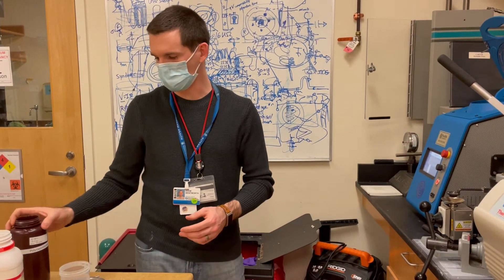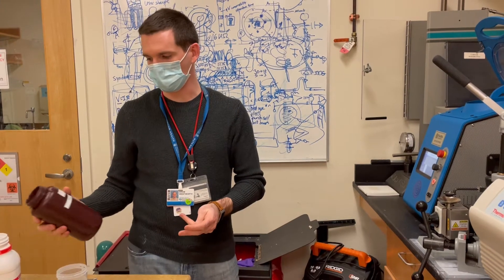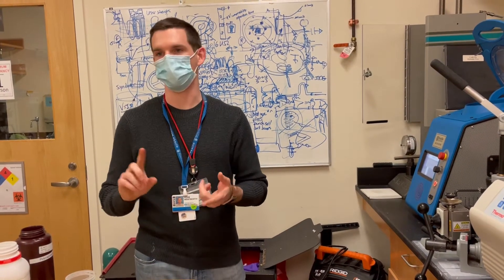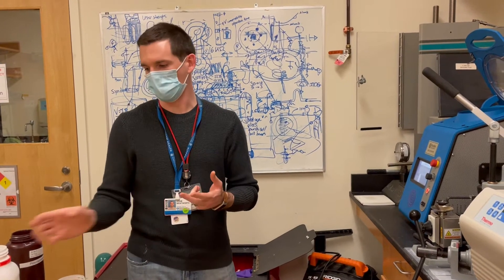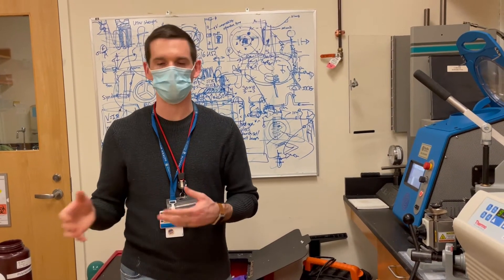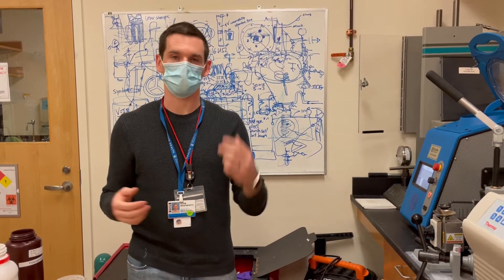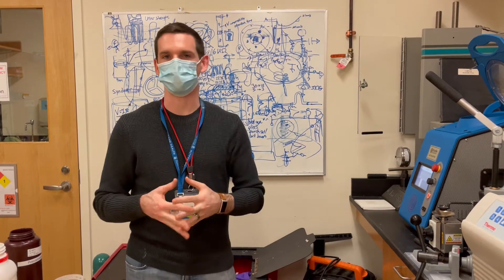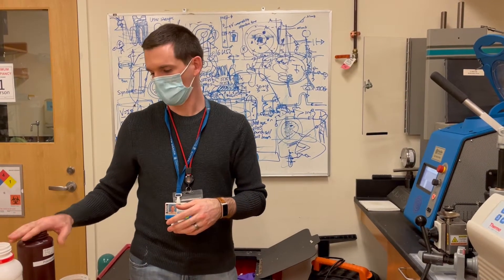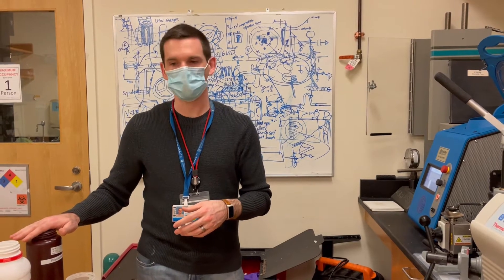We're going to use it today to mix polycaprolactone and some other powder — in this case we're using barium sulfate as a radiopaque agent. So if you make a medical device and put it inside an animal, you can create composites really quickly with a low melting point thermoplastic and any other component that might mix with it.